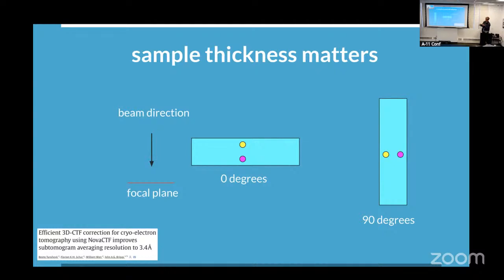So here I've done a very simple 90-degree rotation. And what you see is those particles that were at different defoci just before have ended up, after rotating, at exactly the same defocus. And because we, again, understand the projection geometry, we can back calculate all of these correct deltas that need to be applied to that one defocus value that we typically are able to measure per image. Does that make sense and feel somewhat clear?